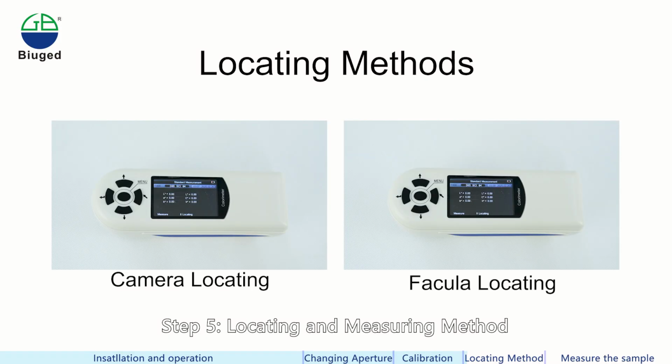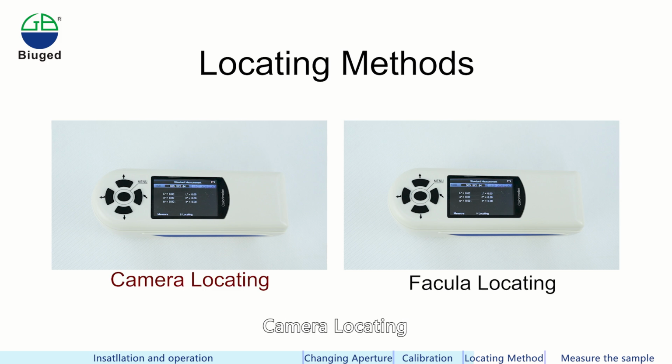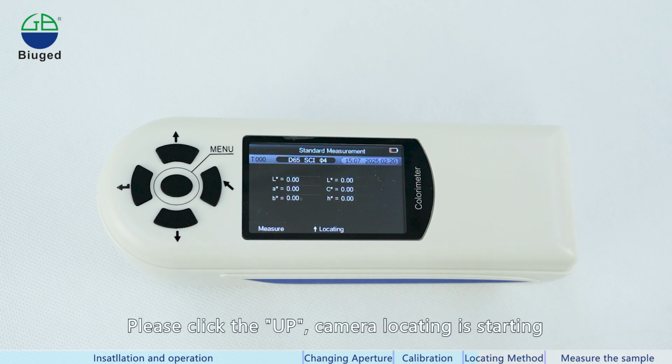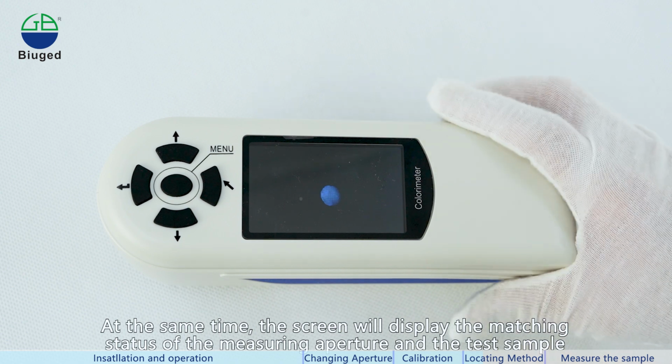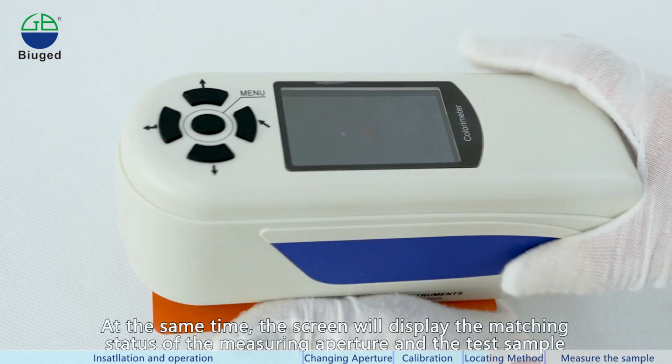Step 5. Locating and measuring method. There are 2 locating methods for the BGD 556. Camera locating: enter the standard measurement or sample measurement interface. Please click the up button. Camera locating is starting. At the same time, the screen will display the matching status of the measuring aperture and the test sample.